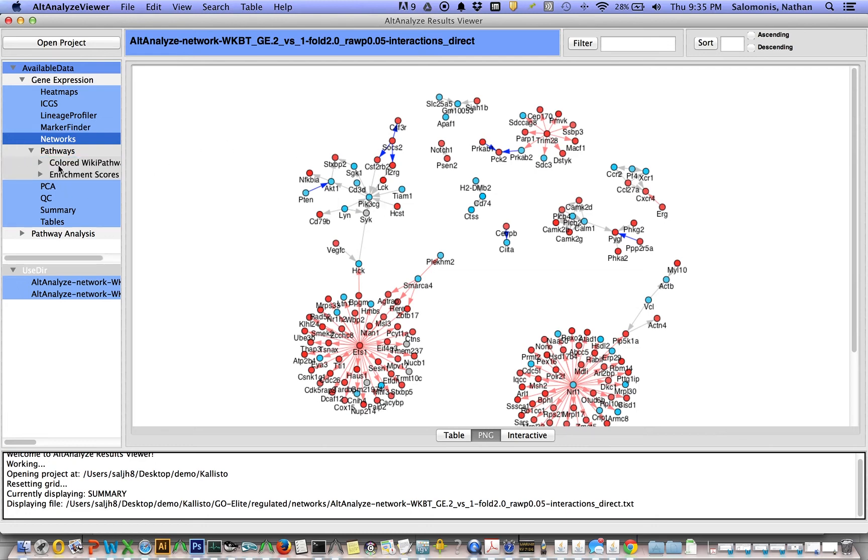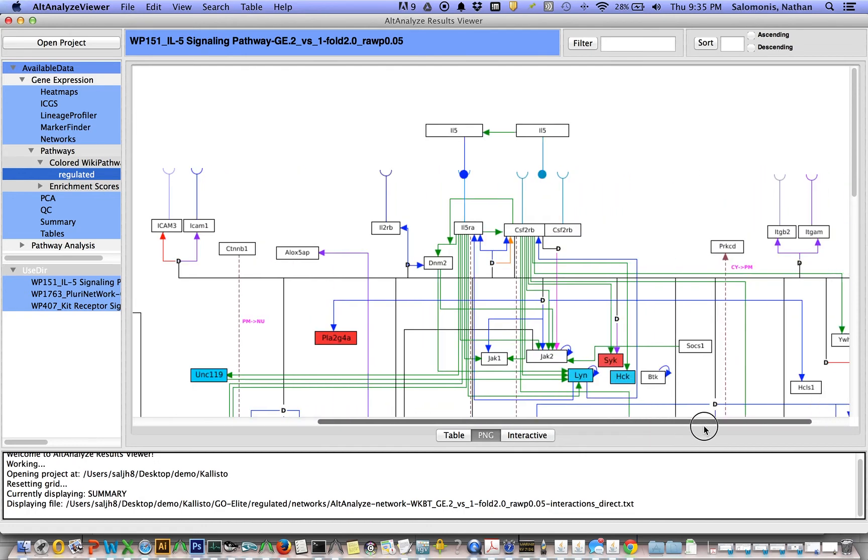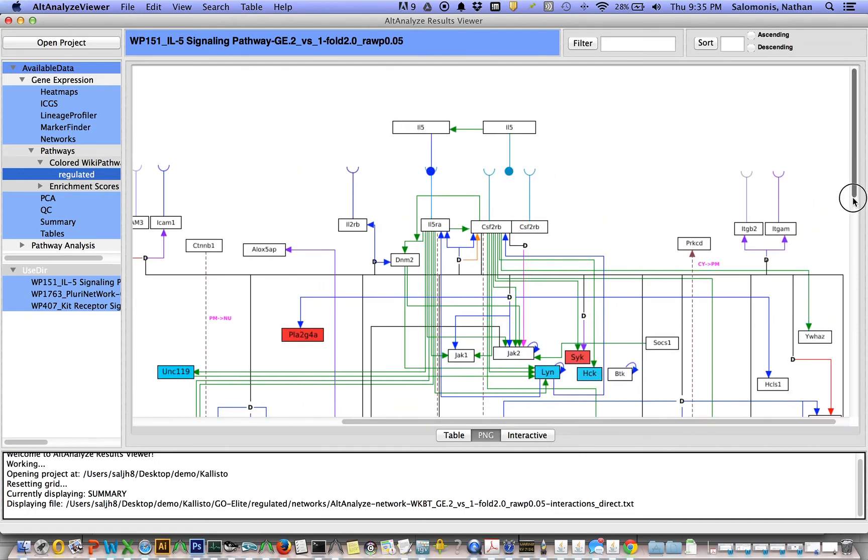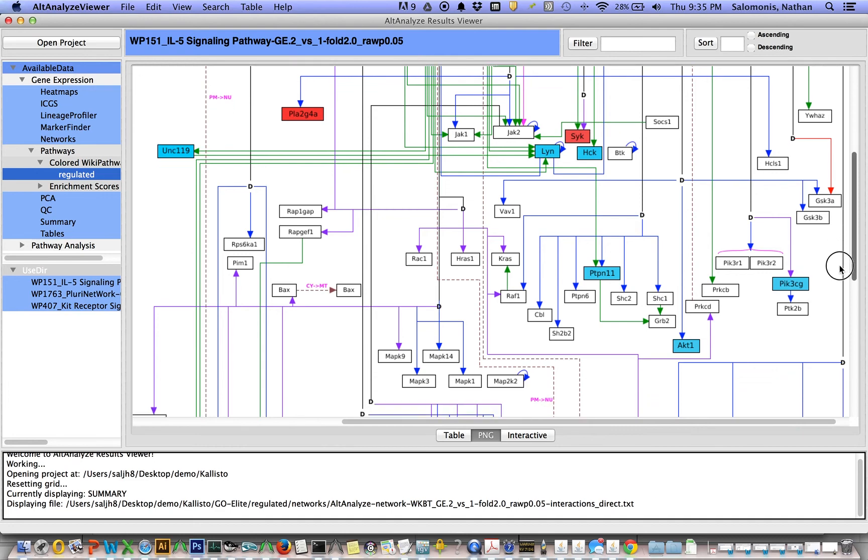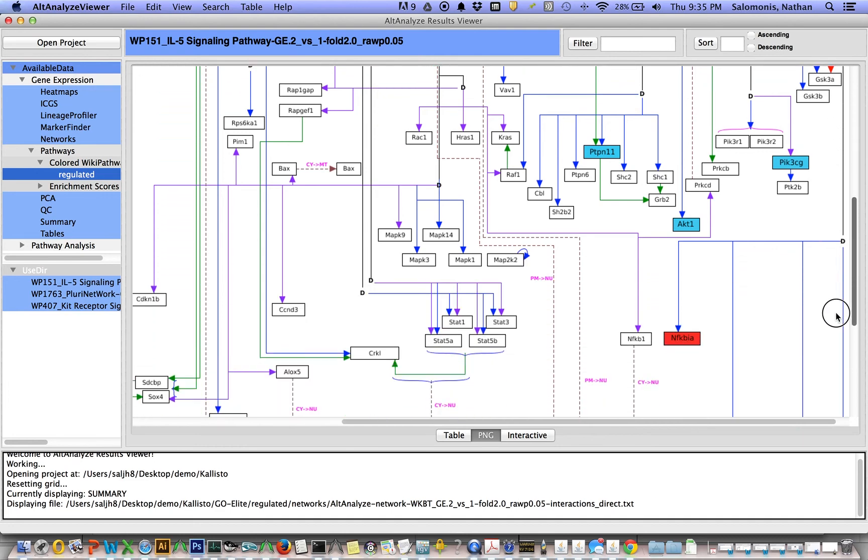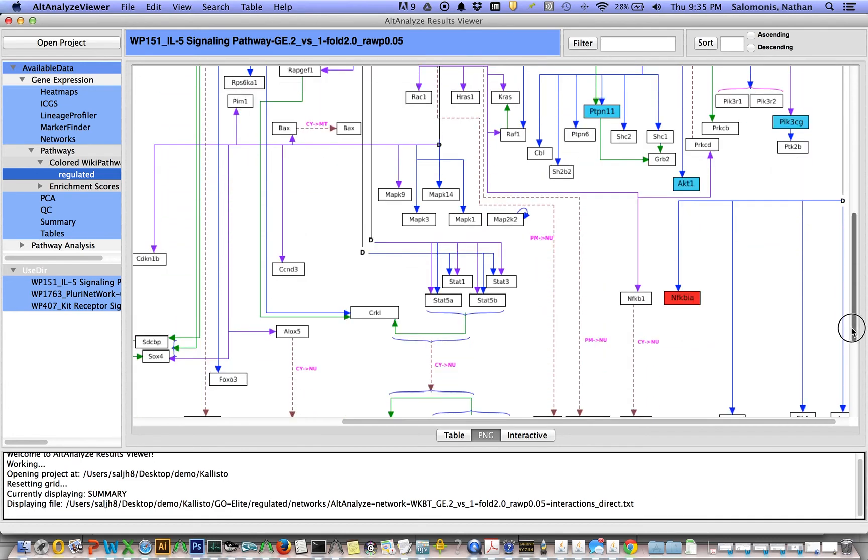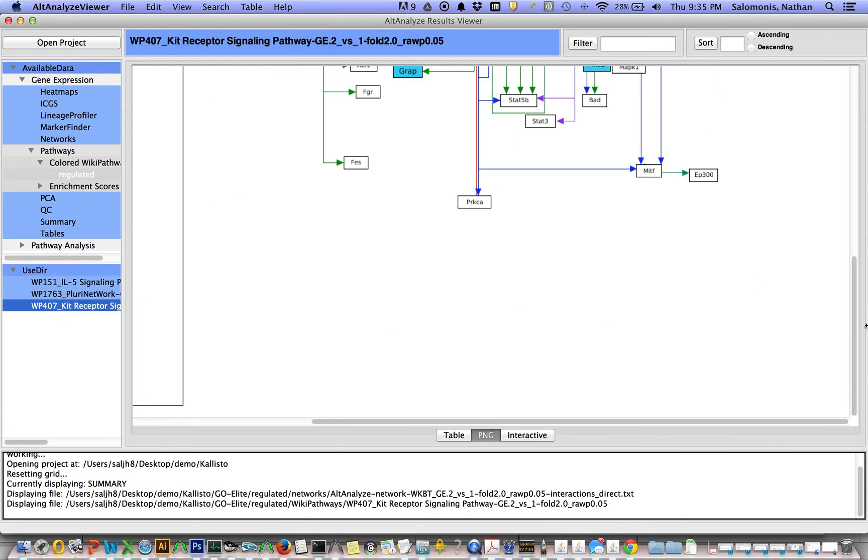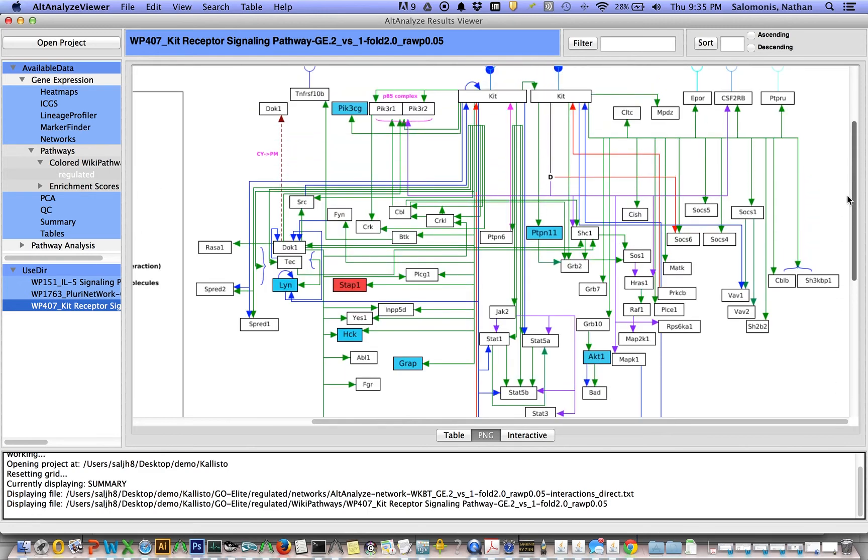You can also look at differentially expressed genes on pathways. And so here these are colored pathways because we chose to visualize enriched pathways with differentially expressed genes. Again, red is upregulated, blue is downregulated. And you can look at these different pathways. You can just click through them. In this case, there were only three pathways that were significant in this analysis.